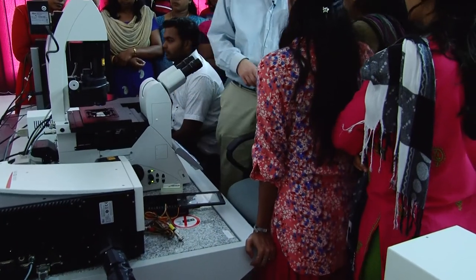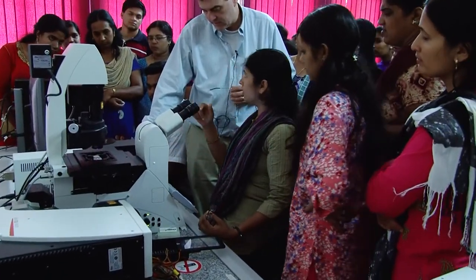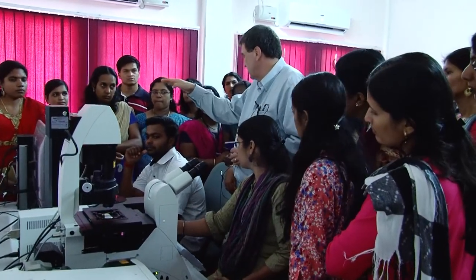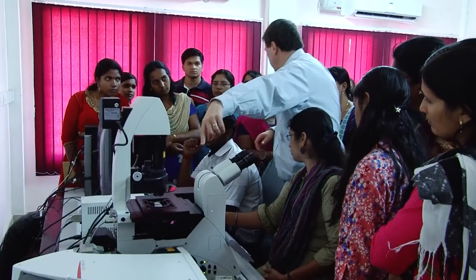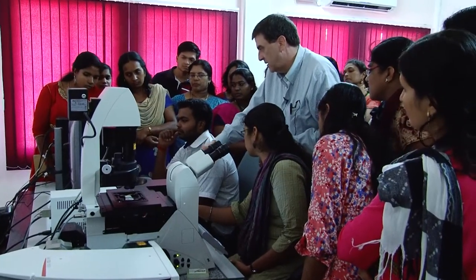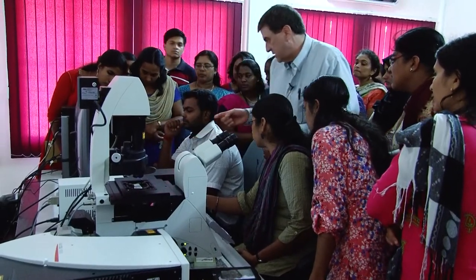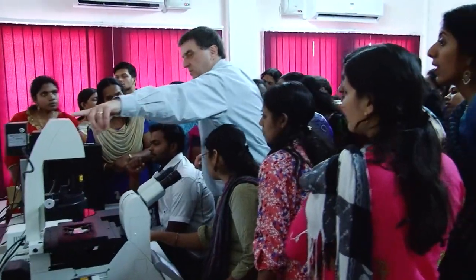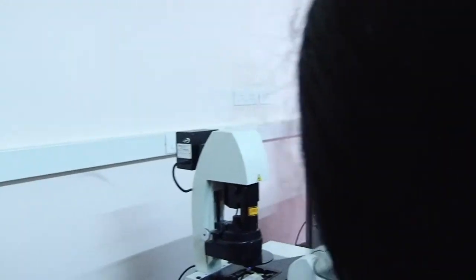Somebody want to try to focus it, see if we can get a better image? Come on over, just focus it, look at the screen, see if we can get it a little bit better. So this is focus. You don't have to look with your eyes anymore, because once you start using the laser through the confocal, your eyes are out of the ball game. It has a safety mechanism in here, so once the laser starts, it will not go to the eyes. So what she's doing here, she's moving up and down in Z. The confocal is scanning. See how the focus is changing where she's at? Like I said, once the laser starts, this has a safety mechanism so the laser can't hit you in the eye, because it's not good for you. I mean, you don't want a laser in the eye.